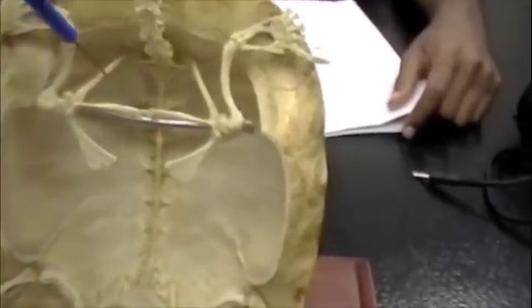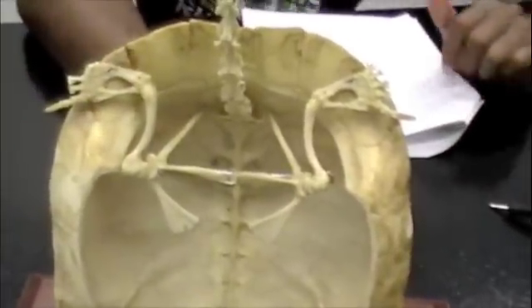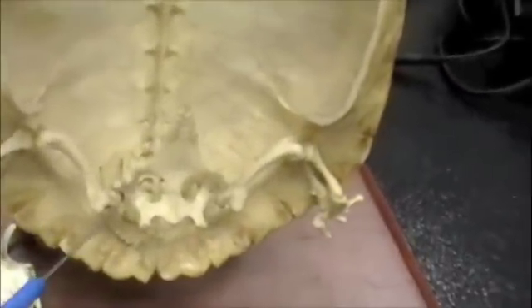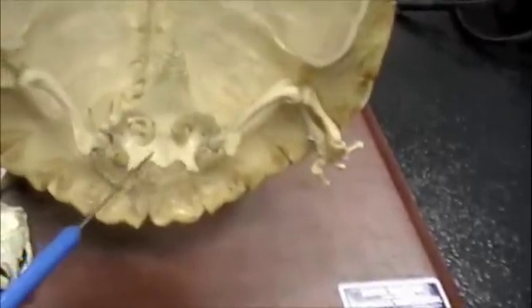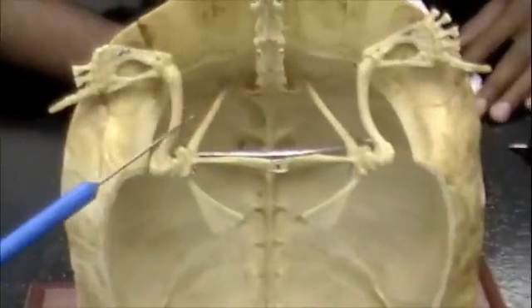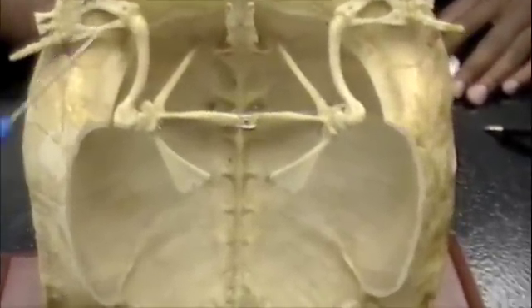And the acromion are these back here. Acetabulum is here. And the pubis. Humerus. Ulna, radius.